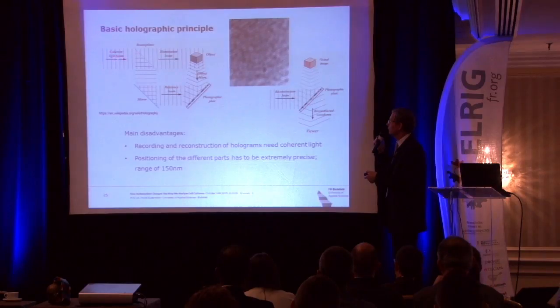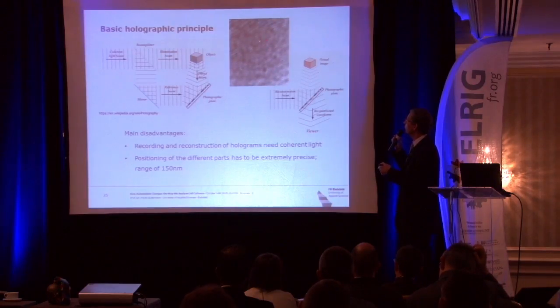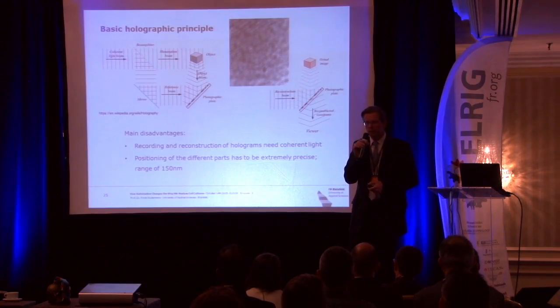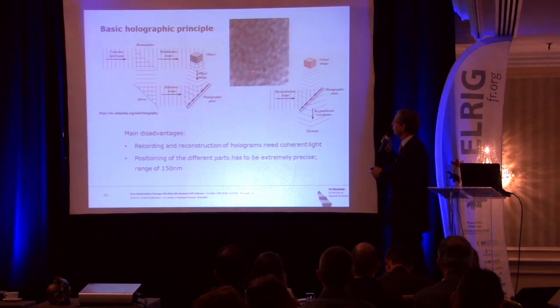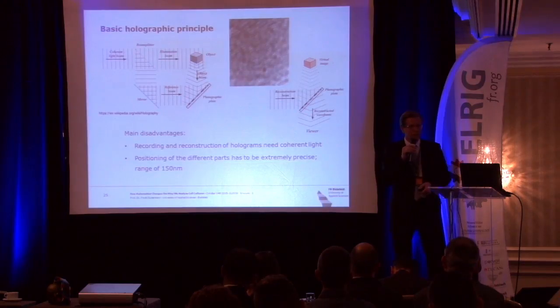You have to establish or to use a laser beam, coherent light, illuminate the object. You can also go through the object here and have a reference beam, and the interference pattern is being monitored with a CCD camera. The interference pattern looks like this. This is a little toy car, as you can see clearly. Okay, you can see nothing because you transform the place information into wave information. And that's the phase difference that the object causes in the laser beam. And to reconstruct the image, you have to use a laser beam with the same wavelength, illuminate the hologram, and then you can view from a certain angle and see something like a three-dimensional object.